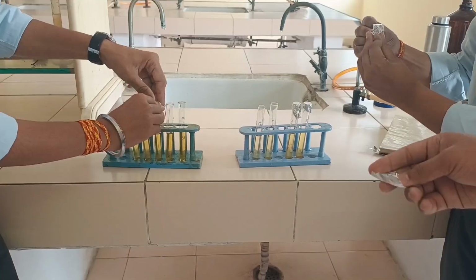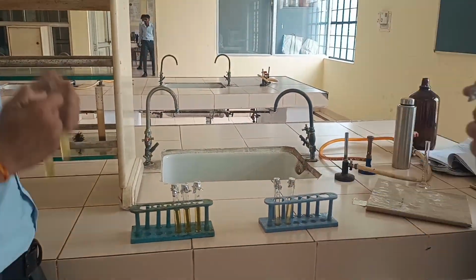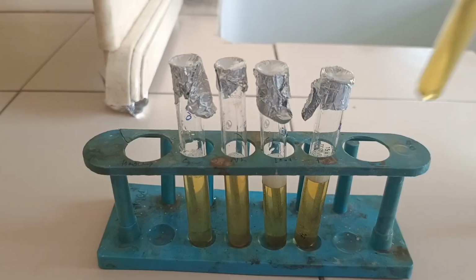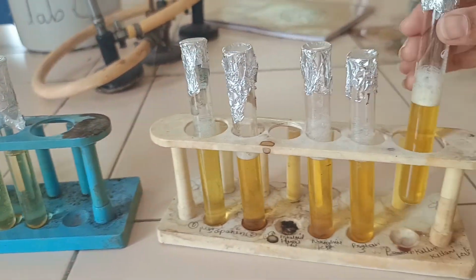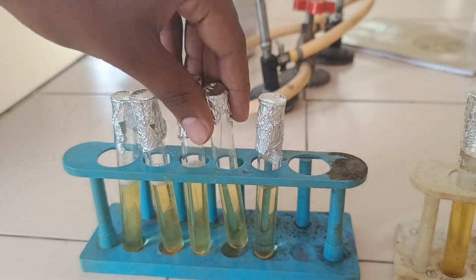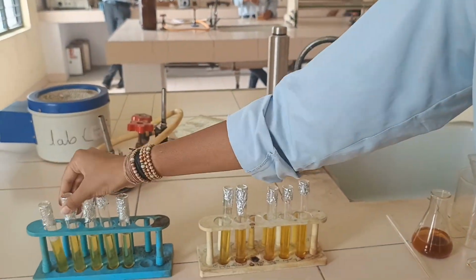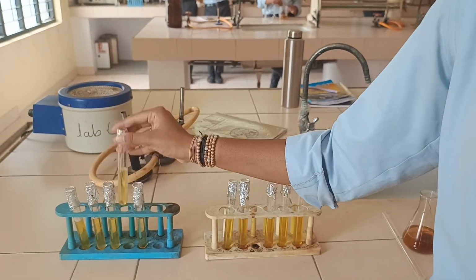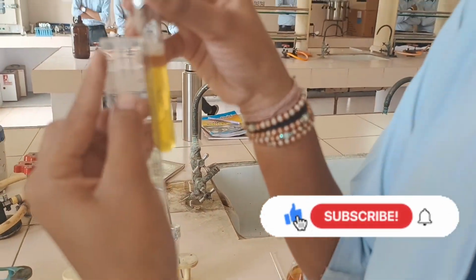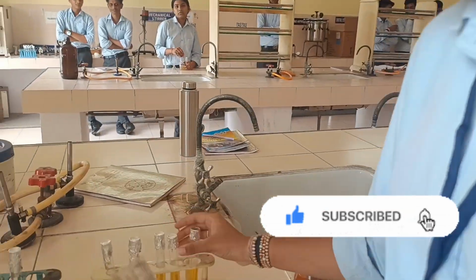Close the test tubes and shake them lengthwise for 15 seconds. Now we can see the formation of foam in all the test tubes. Allow the test tubes to stand for 15 minutes and then measure the height of the foam in all the test tubes. The test tube containing 1 centimeter height of foam is considered for calculating the foaming index. Thank you.